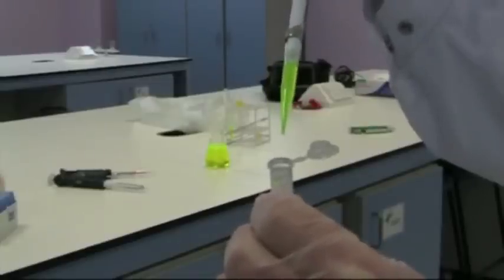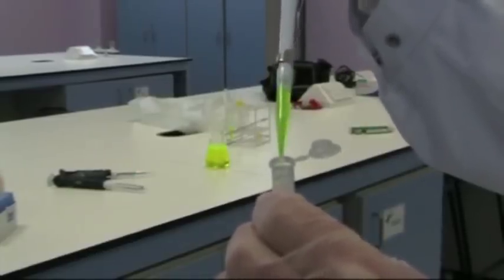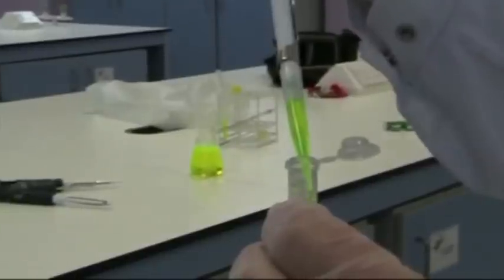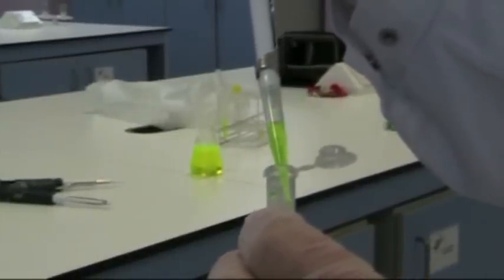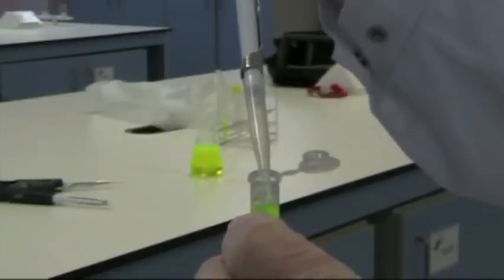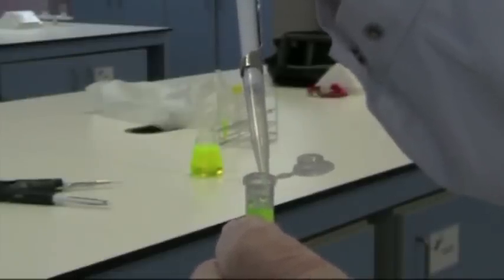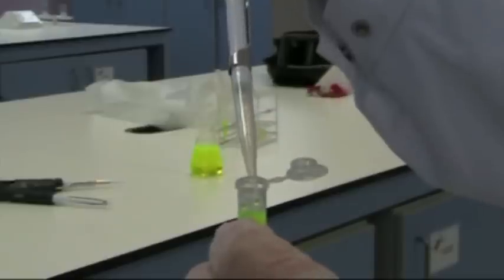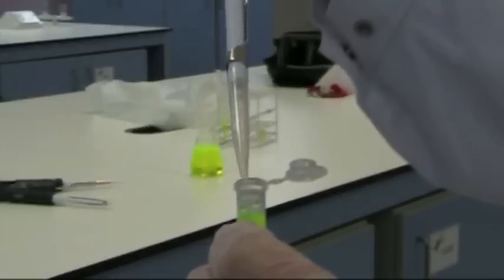We can also use surface tension to dispense the liquid. Place the tip onto the edge, and you can see the droplets are being drawn by surface tension. At this point, now my thumb is fully down to the furthest position on the Gilson, I can draw the tip away from the liquid and release.